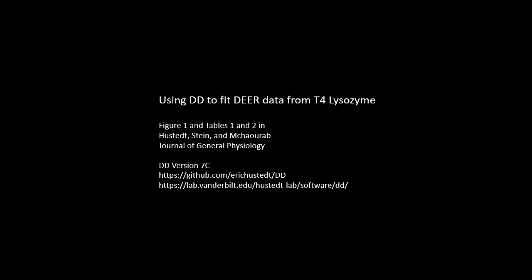Hello. In this video, I'm going to be using the program DD to fit a particular DEER data set we've obtained from a T4 lysozyme sample. The results correspond to those in Figure 1 and Tables 1 and 2 of our Journal of General Physiology paper. And I'm going to be using DD version 7C, which is available on GitHub.